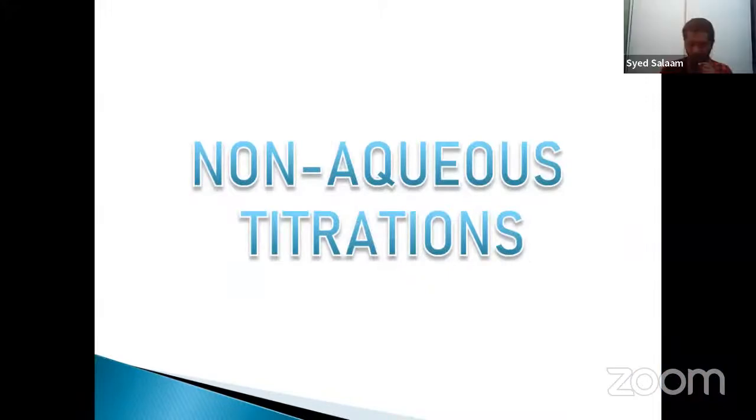Hi everyone. So today let us discuss non-aqueous titrations. Okay, non-aqueous titrations. First of all, by the name itself, non-aqueous means titrations which do not involve water. Aqueous, we know, is nothing but water. So how are you going to perform them?